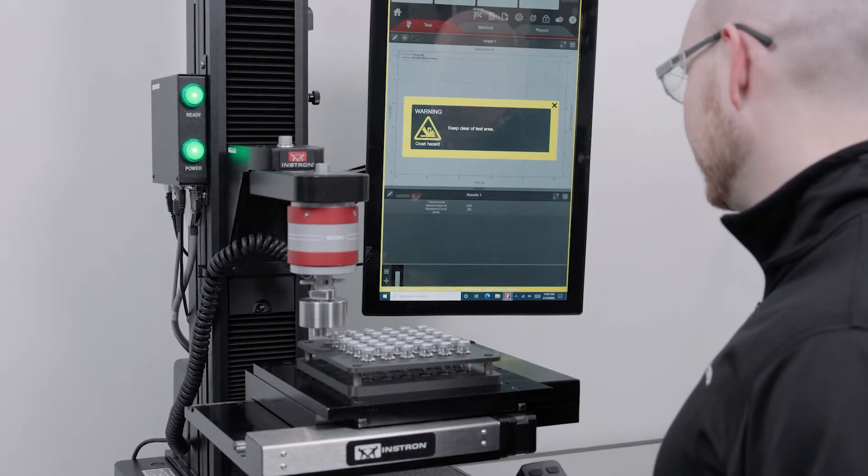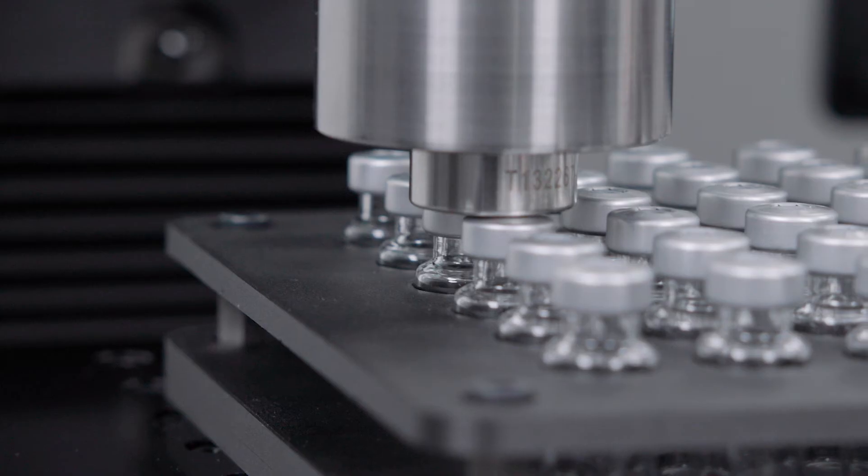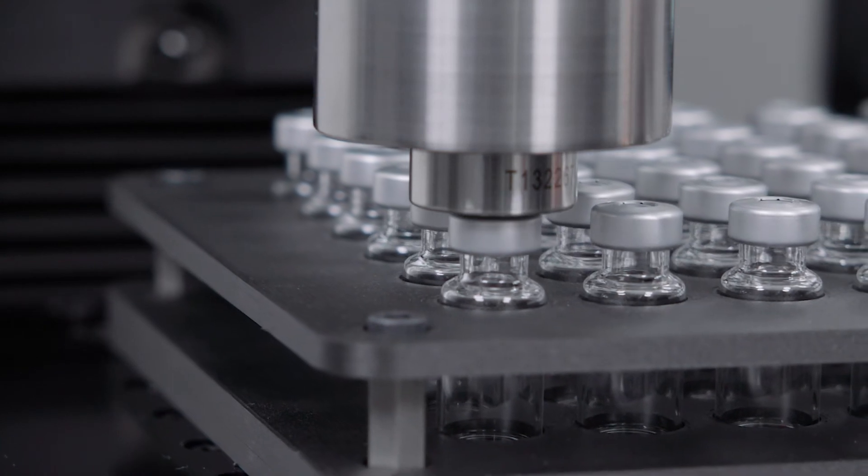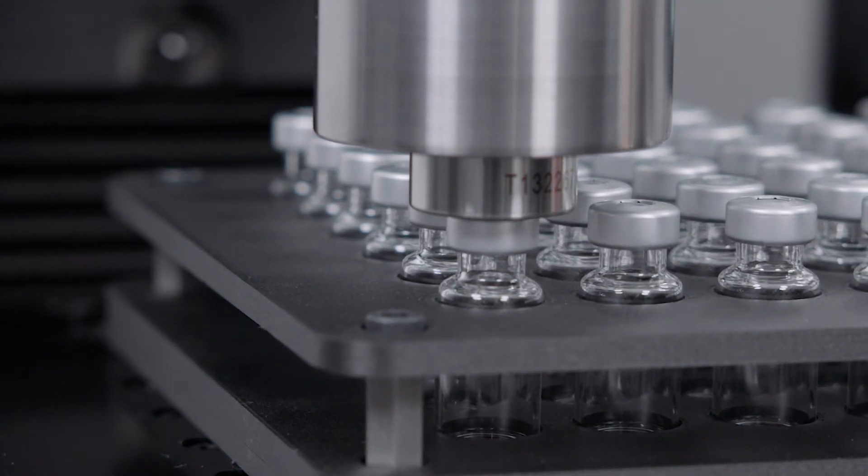This semi-automated add-on for universal testing systems can help dramatically increase throughput and efficiency in your lab by automating much of the testing process.